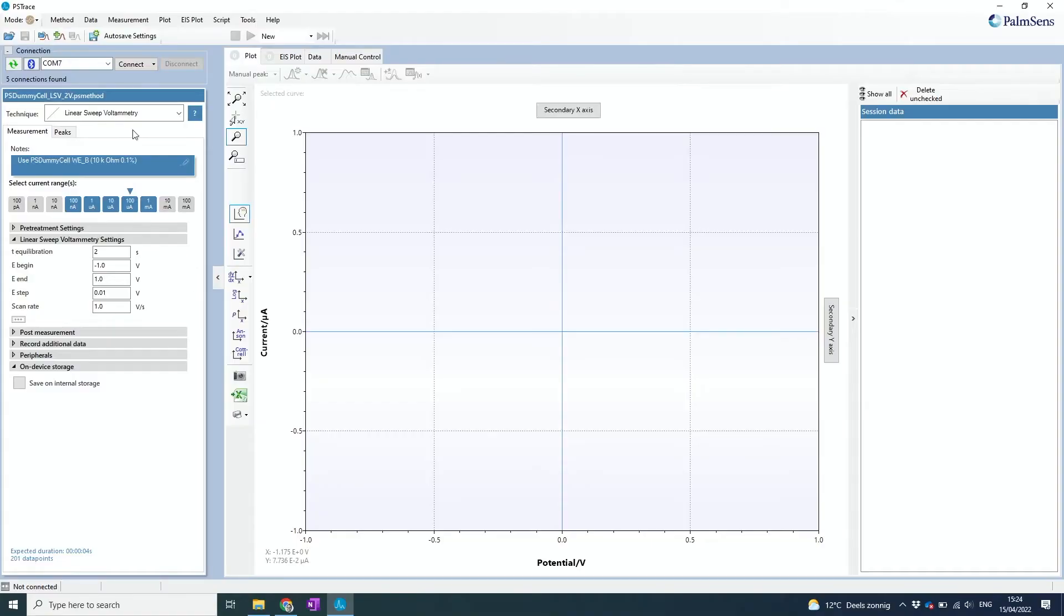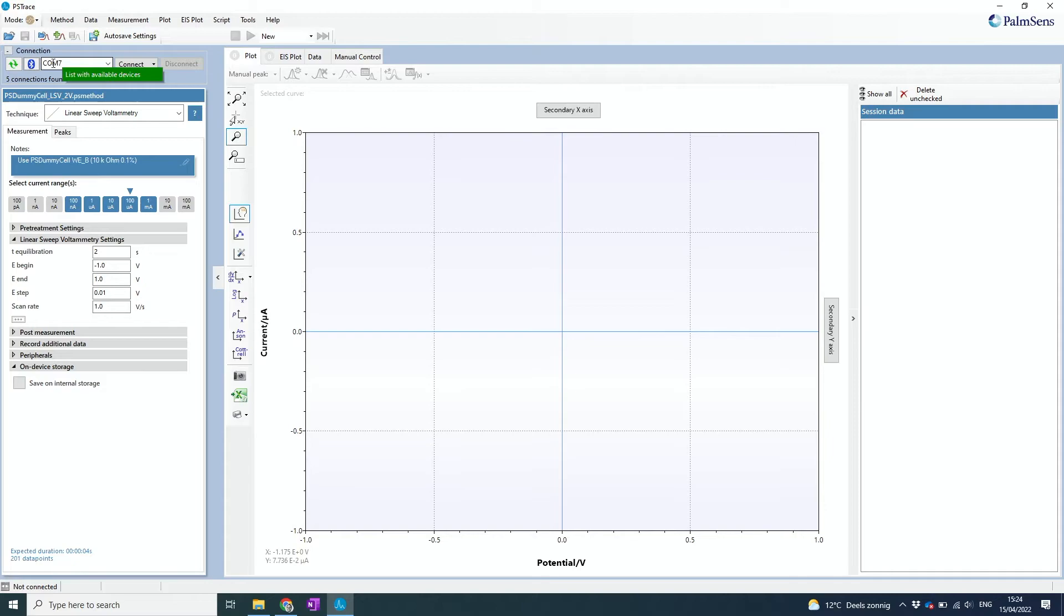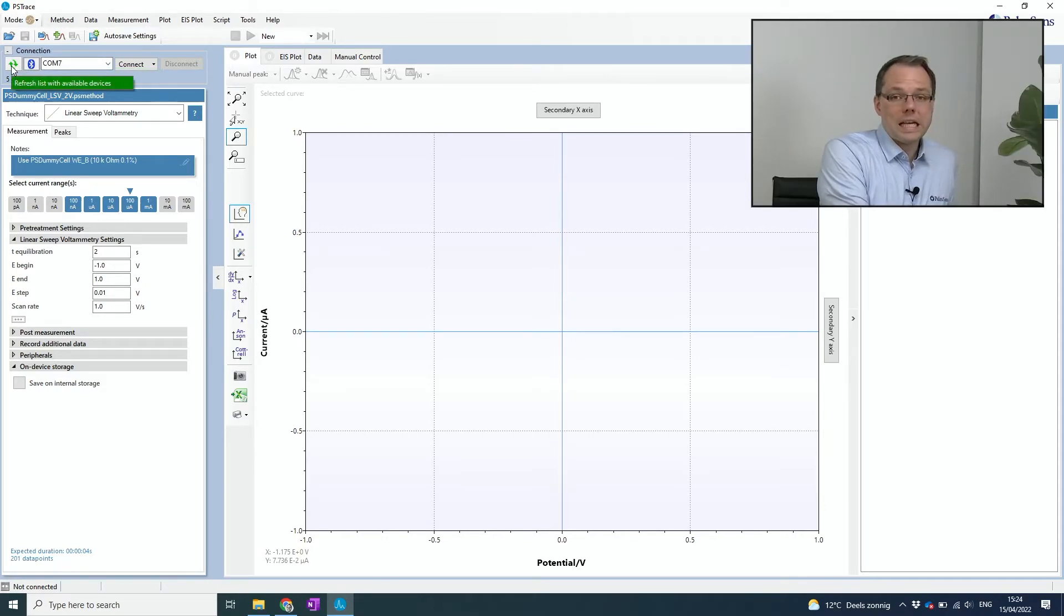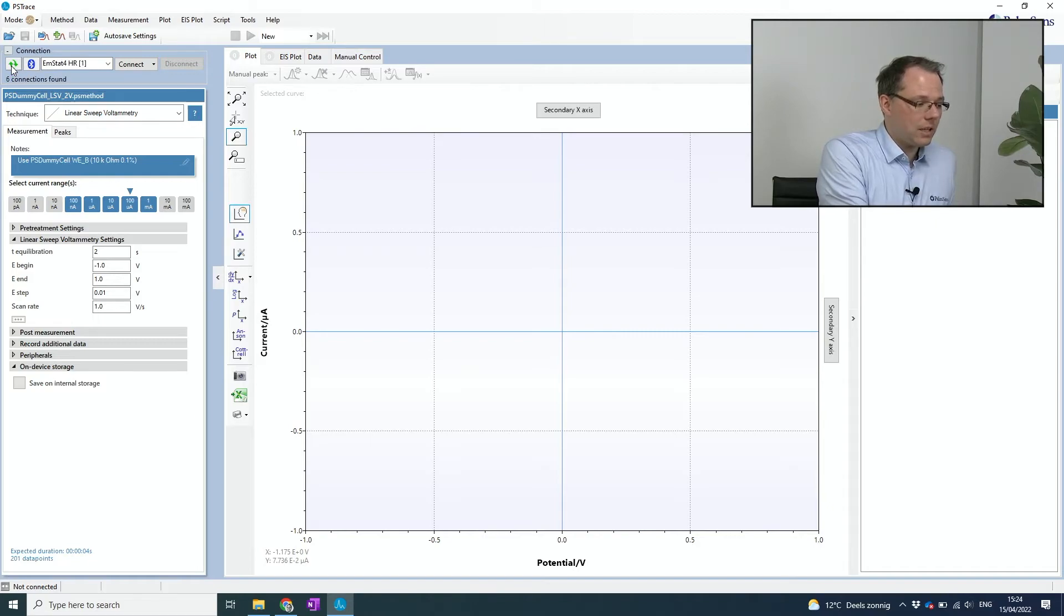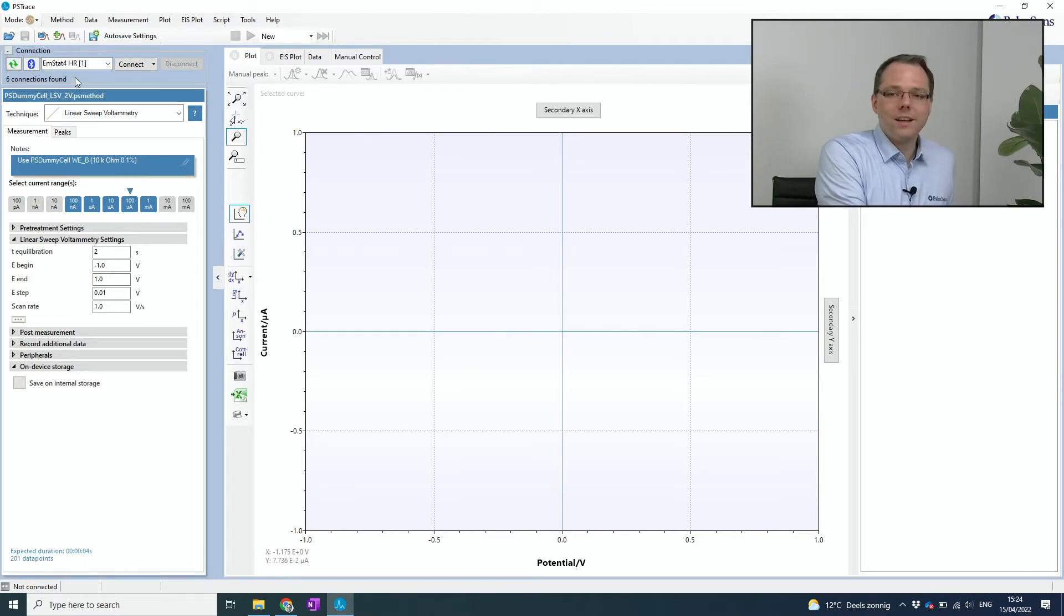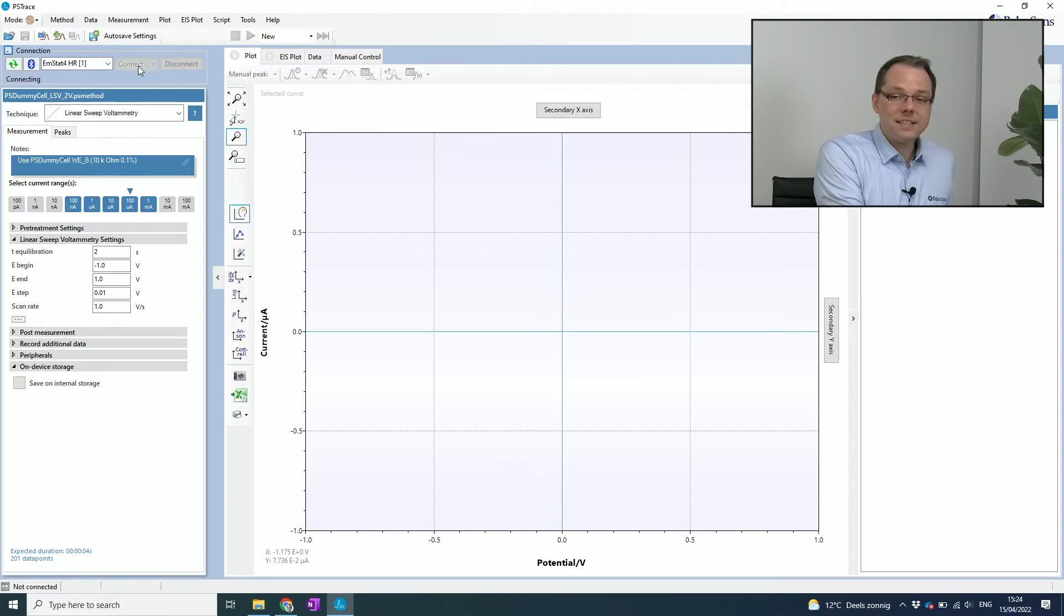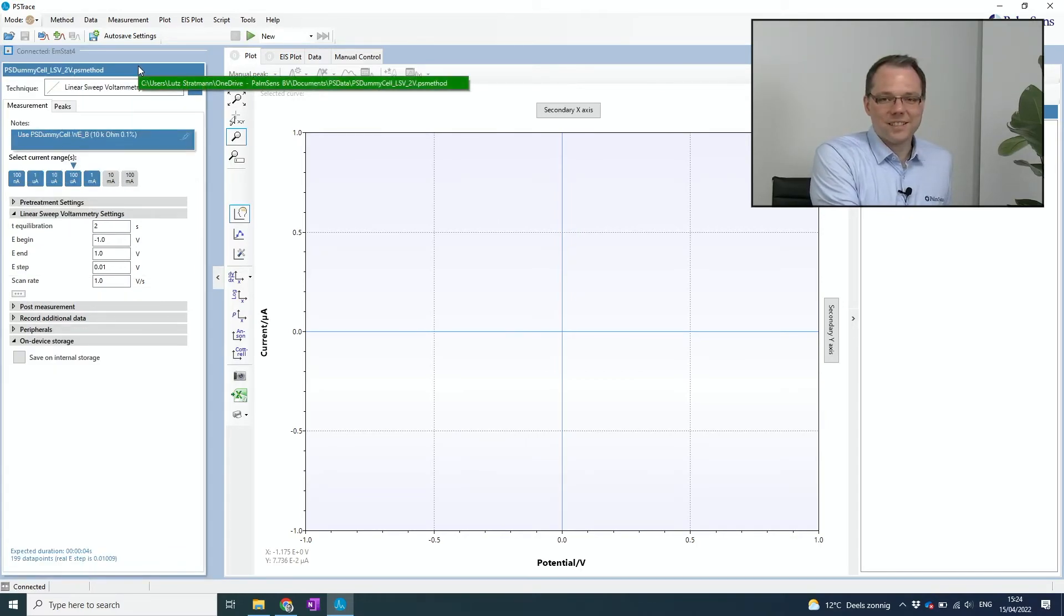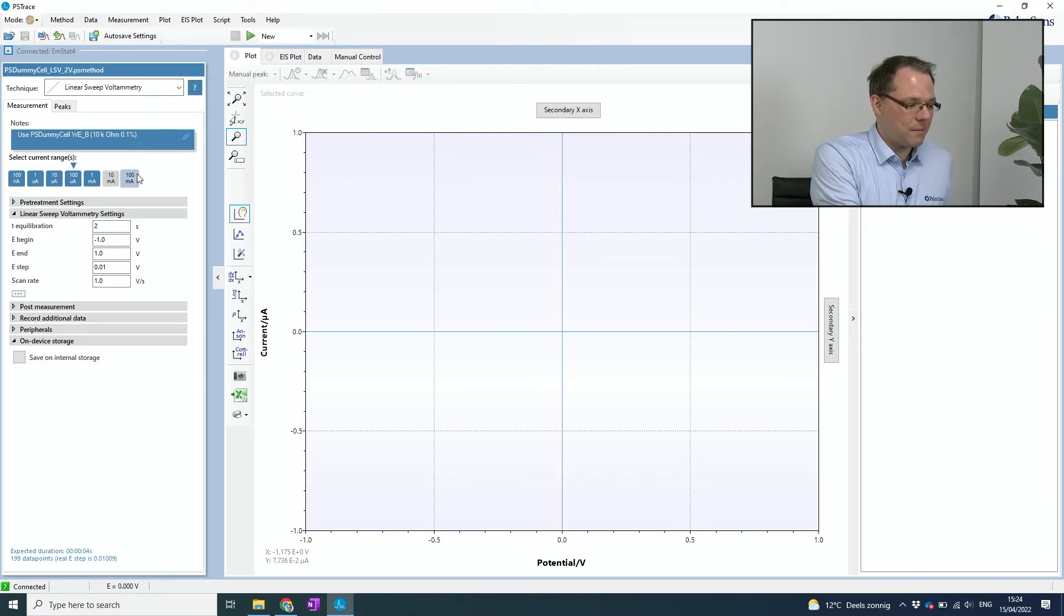Okay, so let's have a look. So first you need to check if in the drop-down menu the potentiostat that you want to connect to is available. It doesn't look like it is, so I just press the refresh button and there it is. So I just press connect and we're connected to the potentiostat.